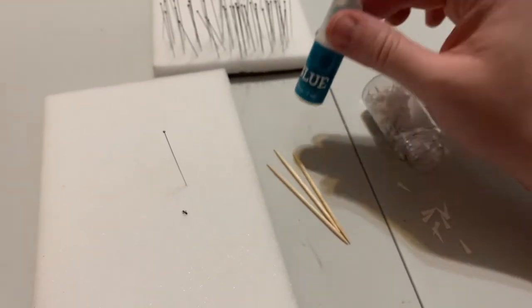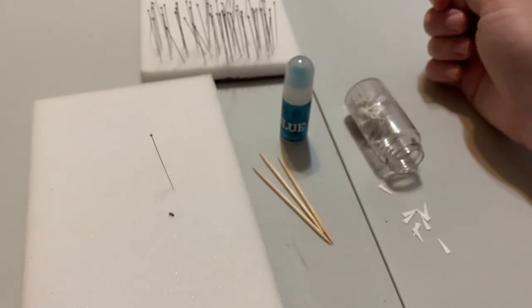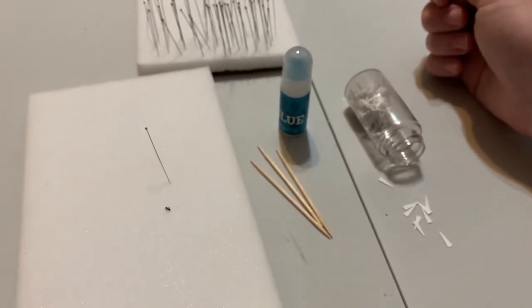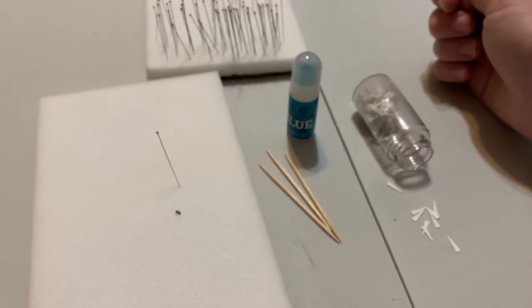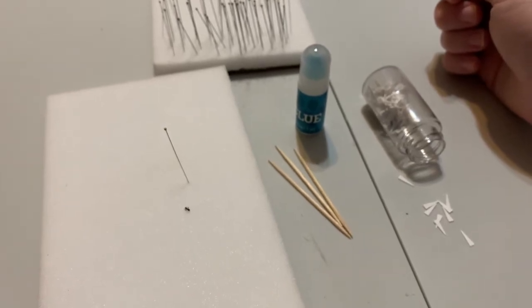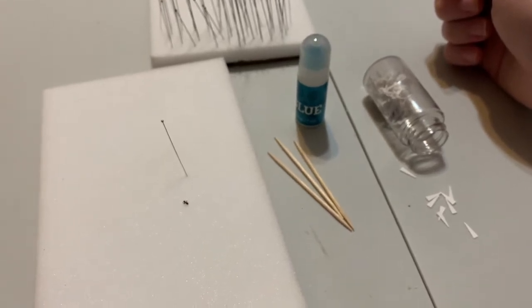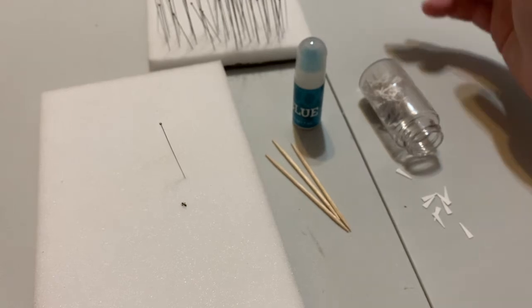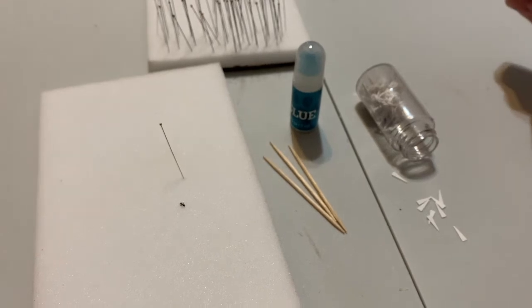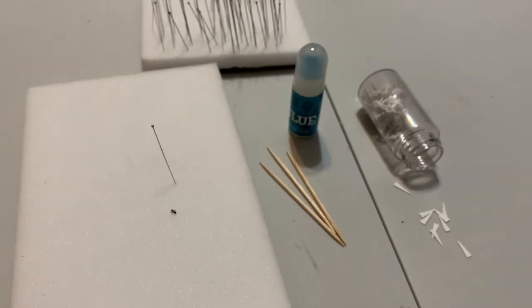It's really important that you use white school glue and not something like super glue, because white school glue is water soluble, which means that if you glue your insect to your point incorrectly, you can remove it with water. If you use super glue, you can't remove it afterwards. This also goes for gluing body parts back onto insects. Not highly recommended, but you can do it. Whenever you're going to glue a body part onto an insect, it should always be with white school glue. Okay, so let's gather our supplies and then I'll show you how we point an insect.